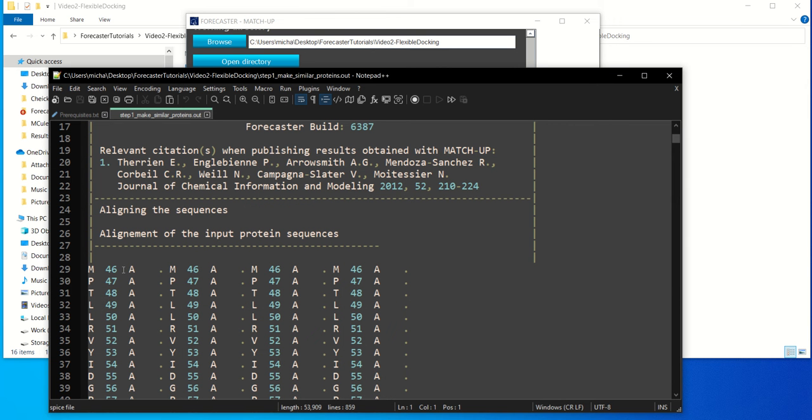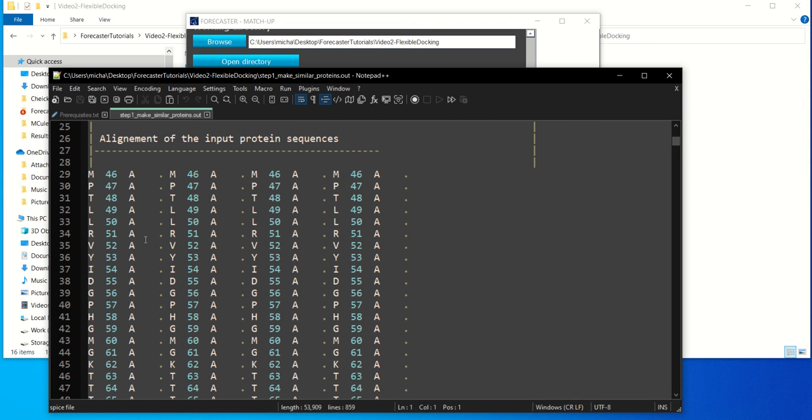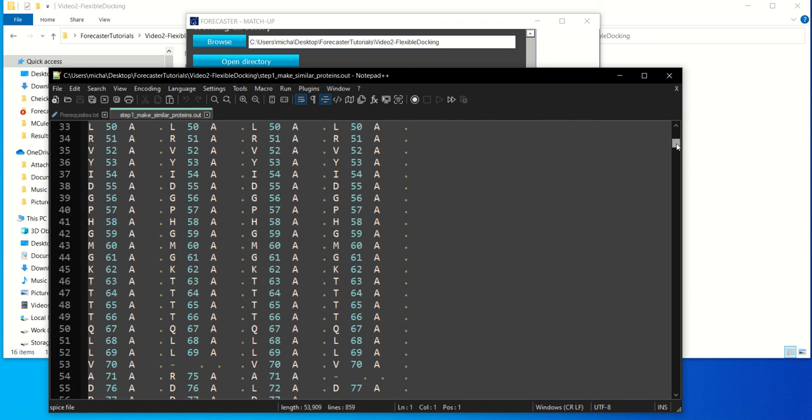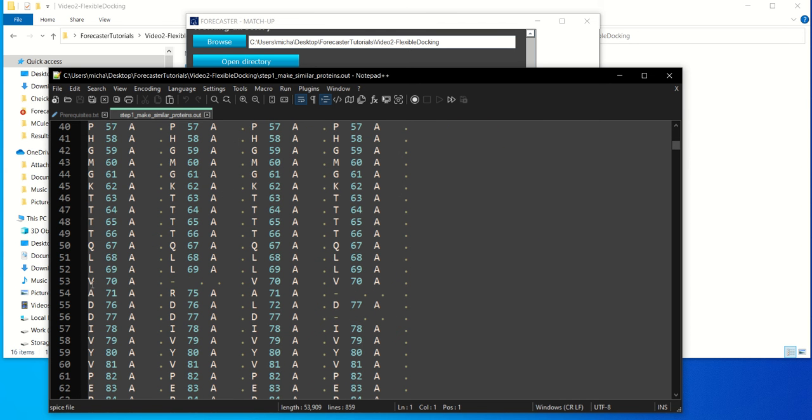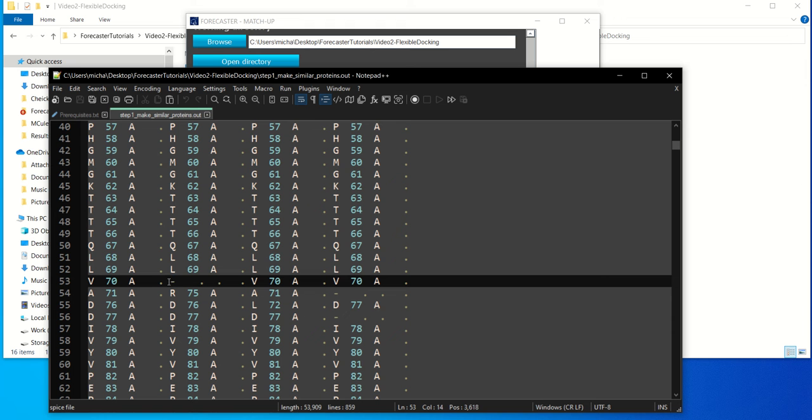And at each position it tells you what amino acid you have. So methionine, proline, threonine. And then you can go down, and if there are any gaps, it will show it as a gap. So for example, which one is this? 1E2P in this case has a gap, an amino acid gap between 69 and 75, so amino acid 70 is missing.